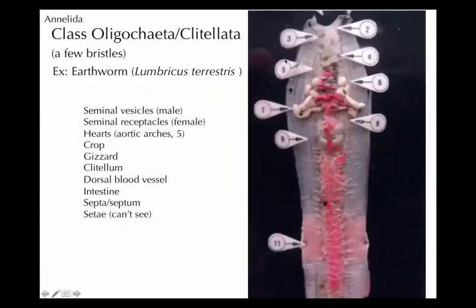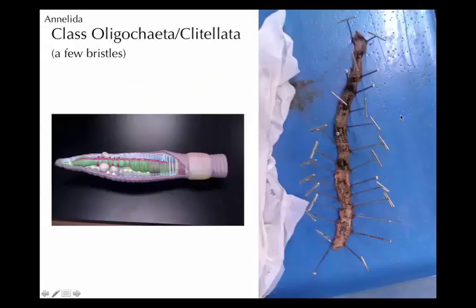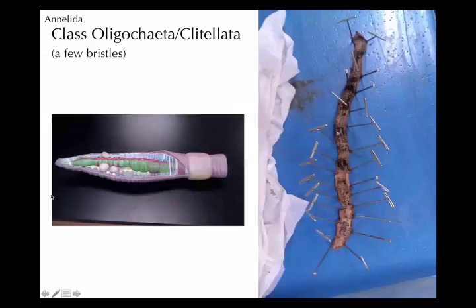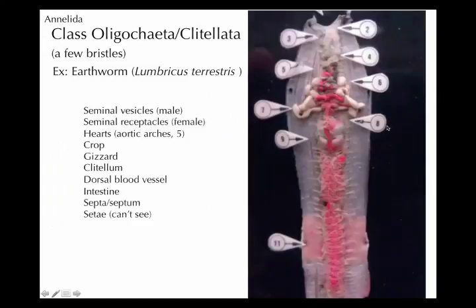Okay, if we look at the dissected, preserved specimen in the box, there are a number of things to notice. I will talk about those, and then I have our specimens here as well as the model, so I'm going to flip back and forth to show you the same part on all of them. First is the mouth, the entry into the digestive tract. The mouth is obviously here on this end. The clitellum is there, so you can tell anterior is closer to that. So that would be a food intake structure.